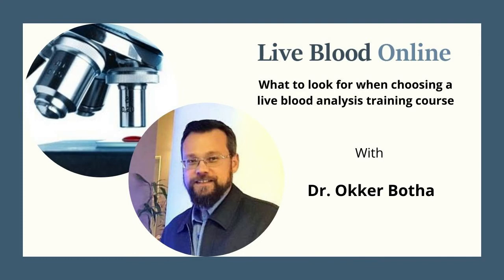In addition to this information, it's also really important to cover the practical aspects of blood analysis. Now, live blood analysis, there is a very large theory component to it. Really important to be familiar with the theory, but also the practical aspects are really critical. Being able to work with a microscope, knowing what settings to use on the microscope when you're using different types or looking at different types of samples. And then also the taking of the blood samples. So actually being able to prepare a blood sample for analysis that's reliable is really important.